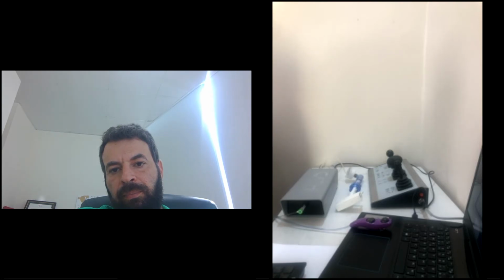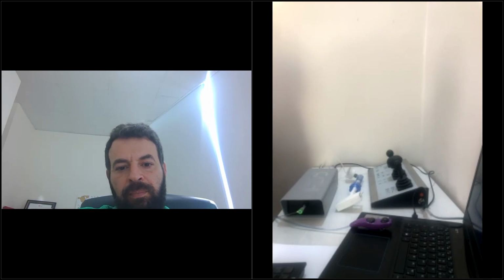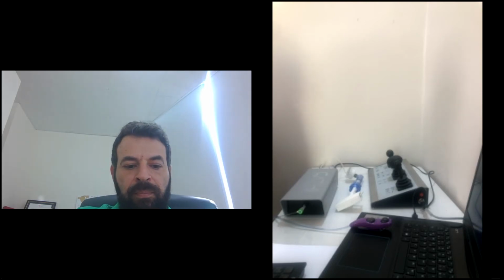Okay, this is the Cathis Smart. I prefer this most because it's a compact one. It's an affordable one. It comes in a rugged case, so I can move around with it from customer to customer. It's a good option for a compact solution. For sure, it doesn't have all the features that the others provide, but yet it's a really great one.